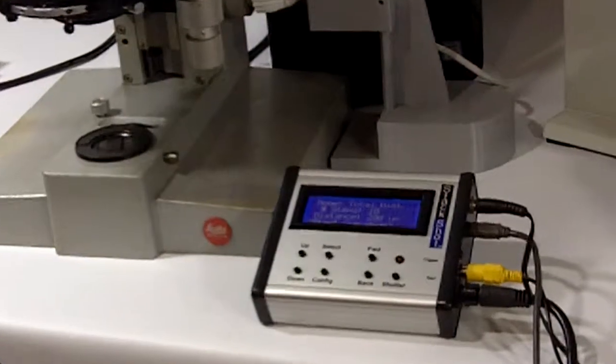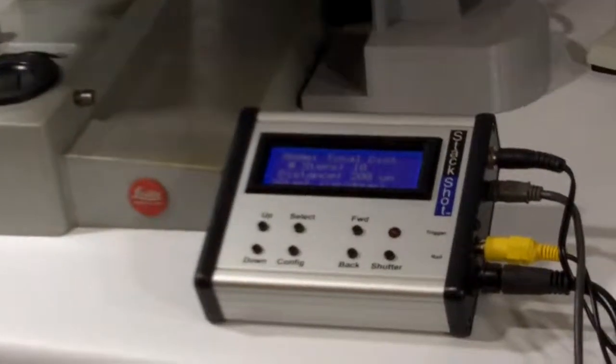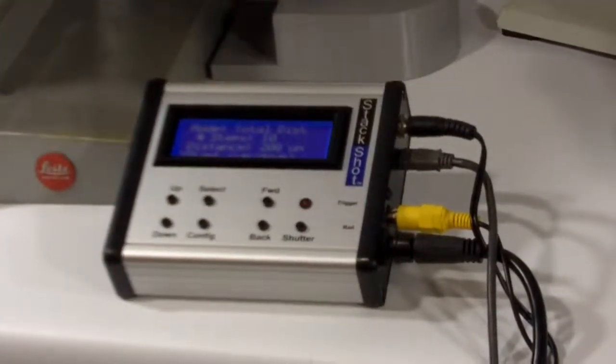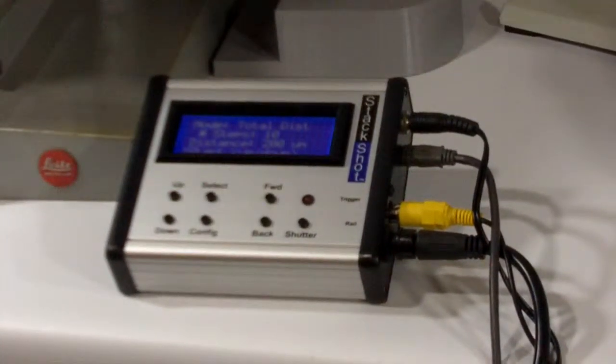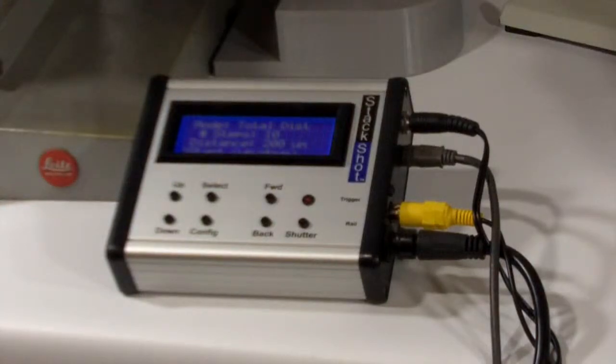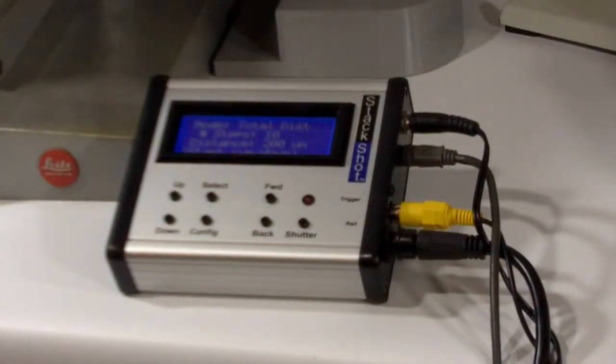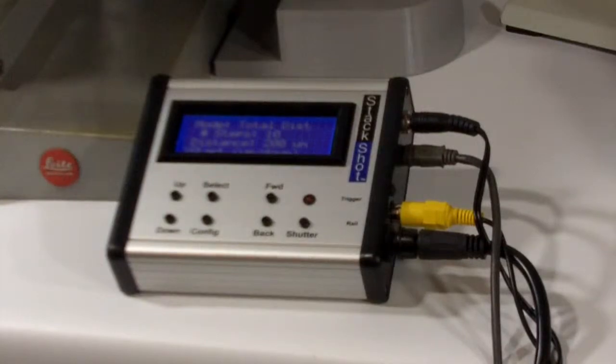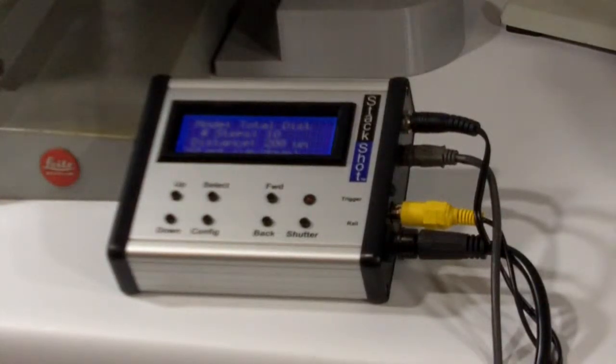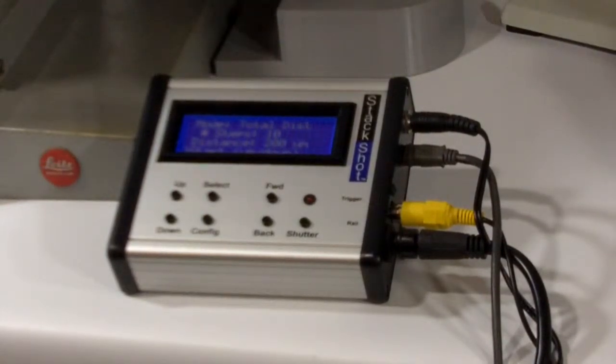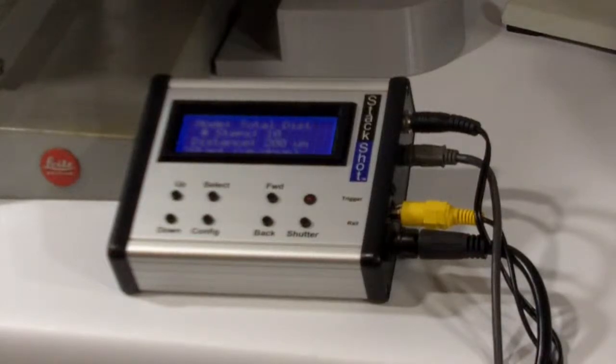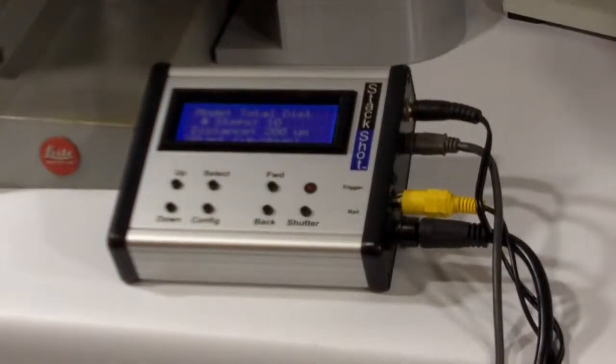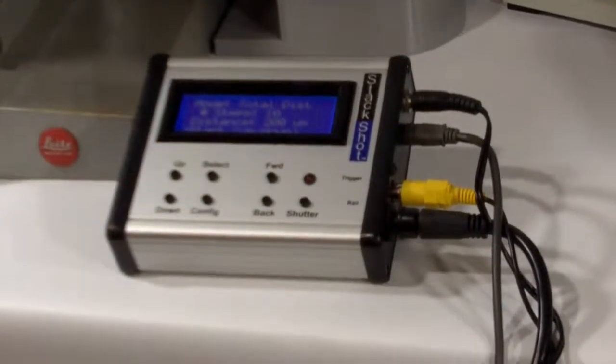The top one is the power cable, the second one from the top is the USB cable, the yellow cable that you see there is actually the shutter trigger for the camera.